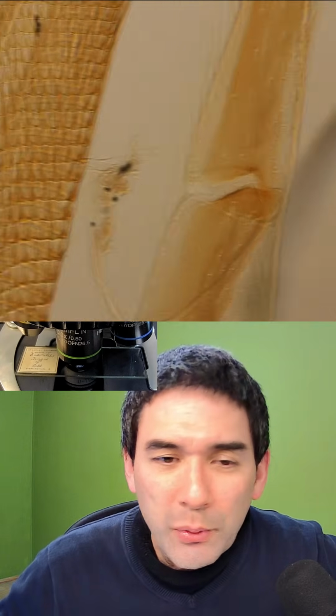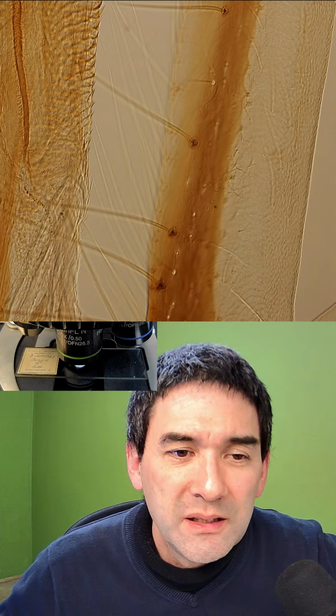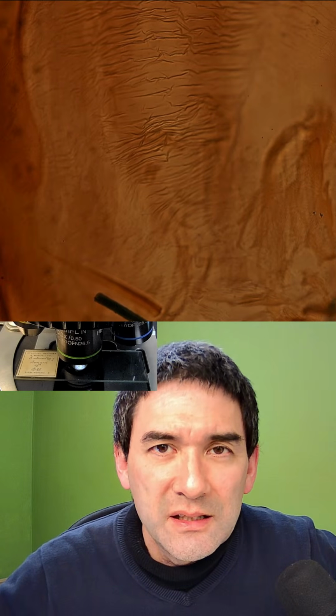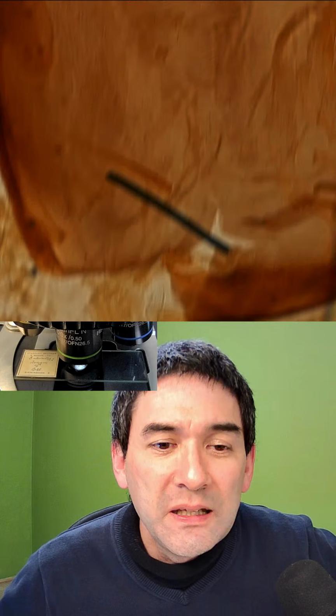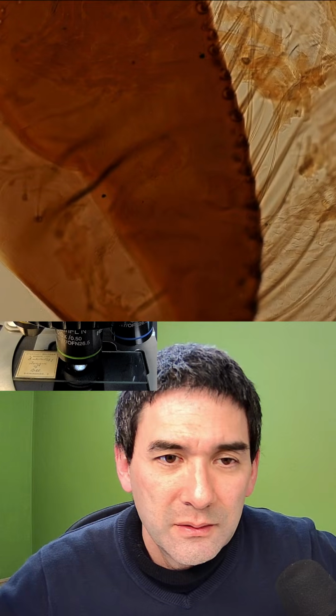So I'm now using polarized light, but this is not just regular cross polarized, this is DIC. The exoskeleton of some insects is very dark, and therefore has to be bleached and brightened up a little bit.